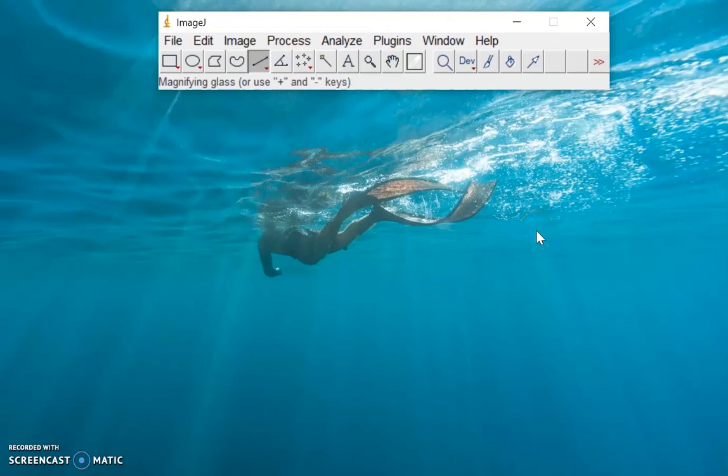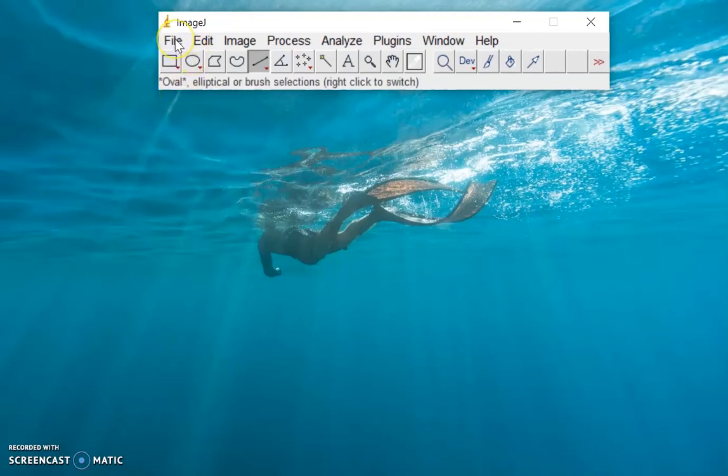Hey guys, so for this tutorial I'm going to introduce to you metadata and spatial calibration for ImageJ.